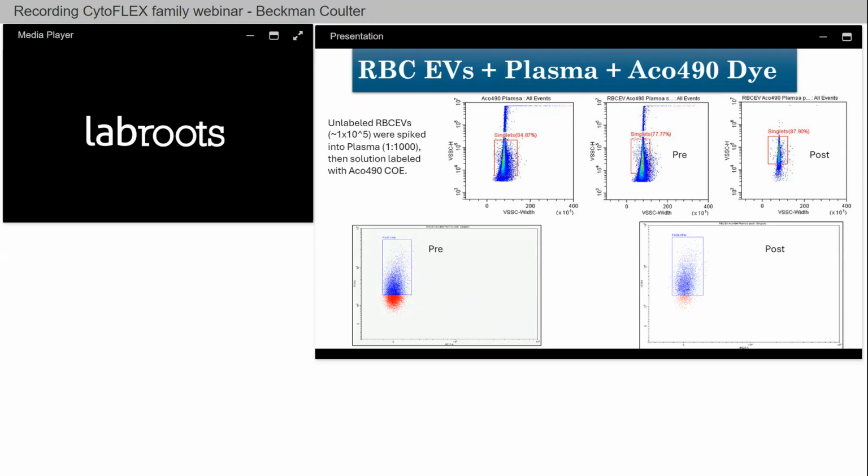This could have some effect too with how it appears to the machine if you don't really get rid of the yellow tinge that is associated with plasma, that kind of yellow orange that occurs, because the instrument will pick up, as we showed before with the refractive index and that whole stained glass kind of approach, how any kind of change to that will change the refractive index and maybe your scatter.